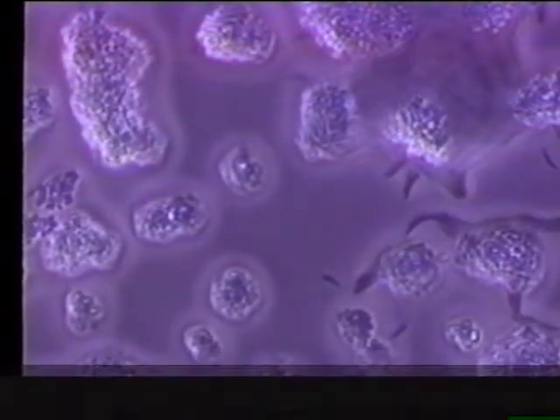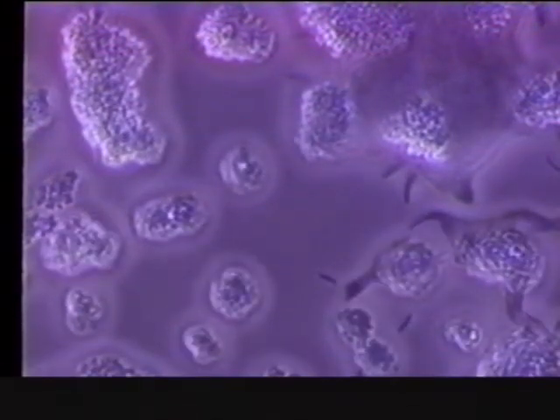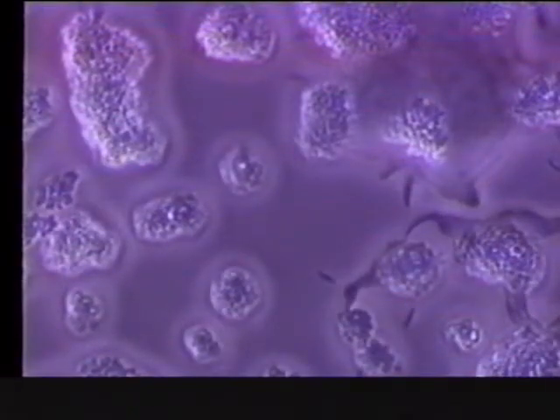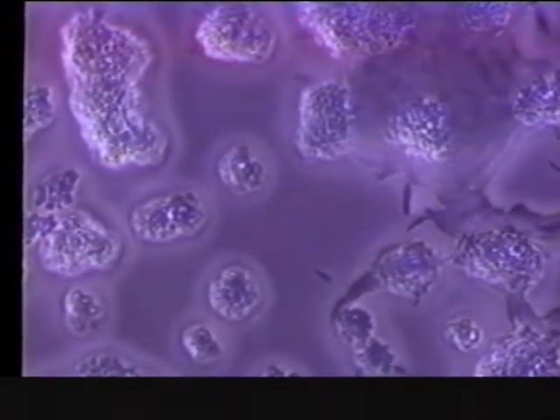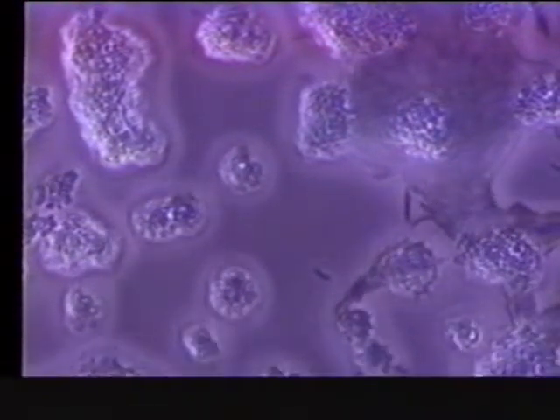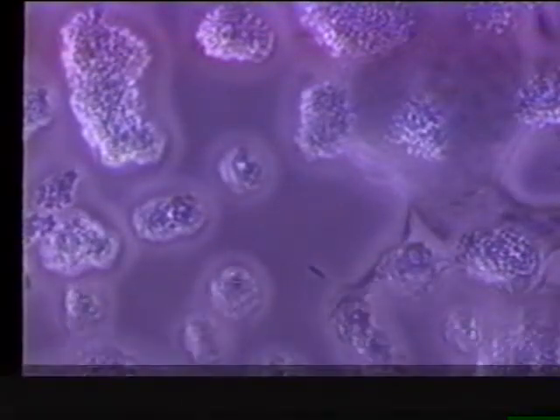Here we will see again the Stigmatella aurantiaca moving towards the microcolonies of Micrococcus, where they will lyse the cells. And at some point, perhaps even before lysis is complete, they will then go to another microcolony of Micrococcus.